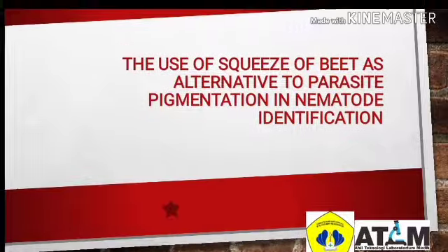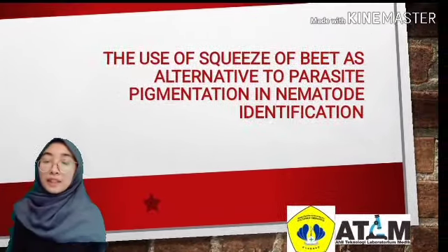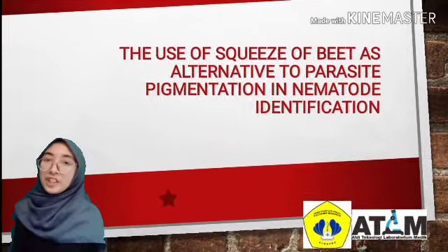In this video, we will present our research proposal: the use of squeeze of beet as an alternative to parasite pigmentation in nematode identification.